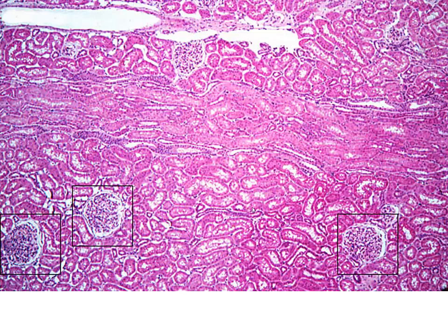A little bit higher magnification, still looking in our cortical region. Here we see 3 of our renal corpuscles. They're going to be surrounded by our cortical labyrinths, which is going to include our proximal and distal convoluted tubules. And then here we have more in longitudinal section. These are going to be our collecting ducts in our medullary ray. And then we get over to the other side. Here we have another renal corpuscle, cortical labyrinths, and then the next ray would be out of this plane of section.